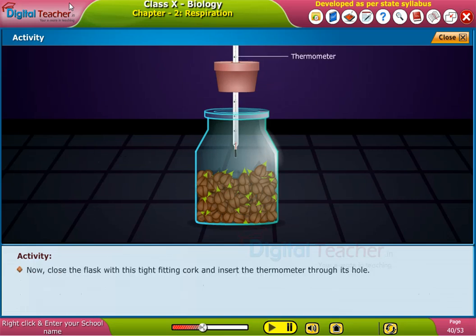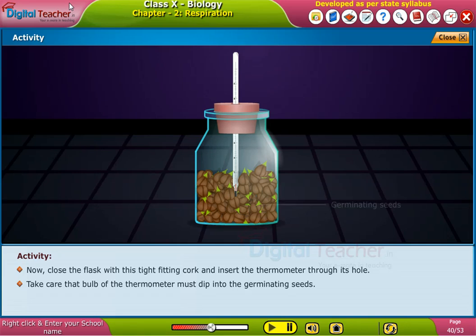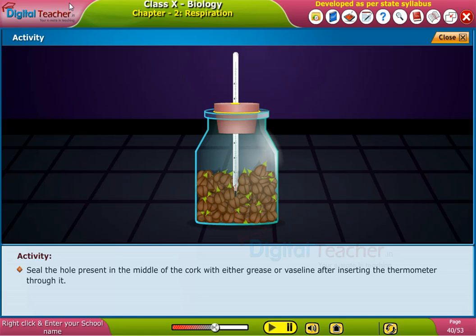Now close the flask with this tight fitting cork and insert the thermometer through its hole. Take care that the bulb of the thermometer must dip into the germinating seeds. Seal the hole present in the middle of the cork with either grease or Vaseline after inserting the thermometer through it.